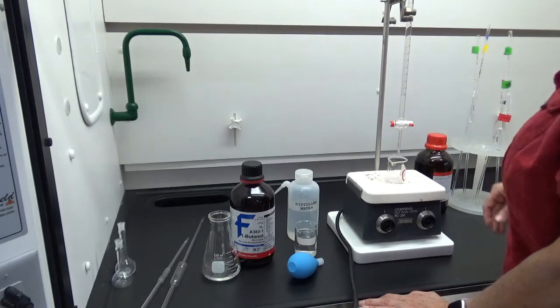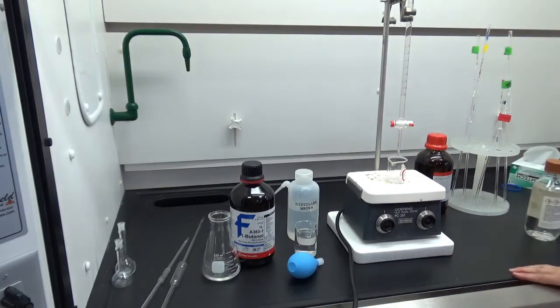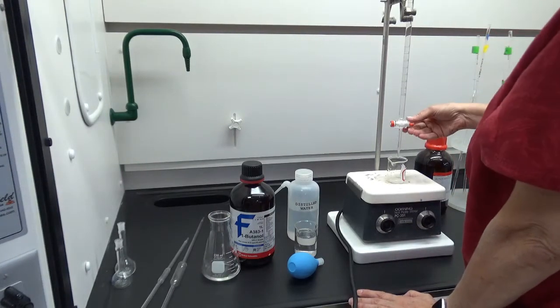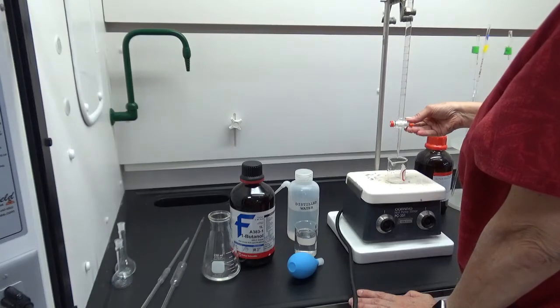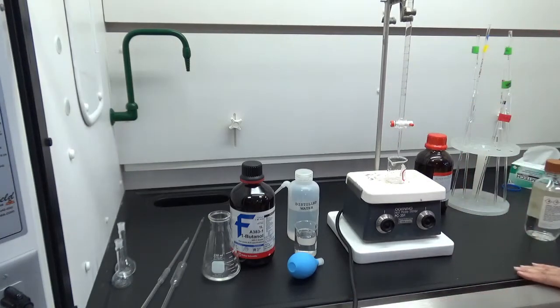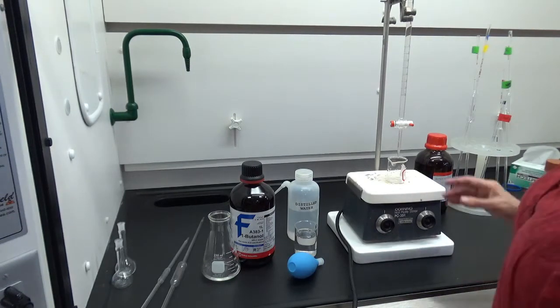All right, that meniscus is on the zero point. Let me see. Oh, that's pretty good. Right, 0.00 will be my initial volume.